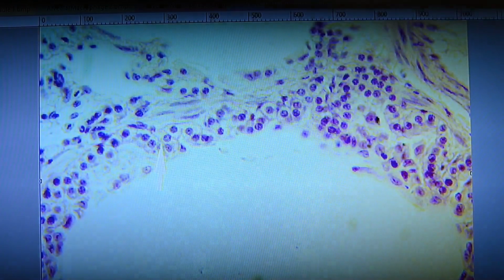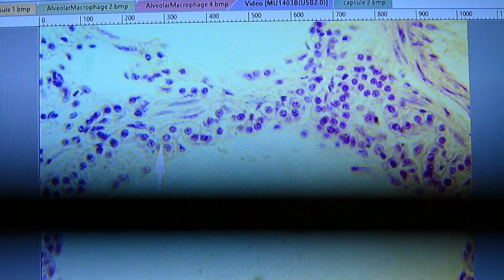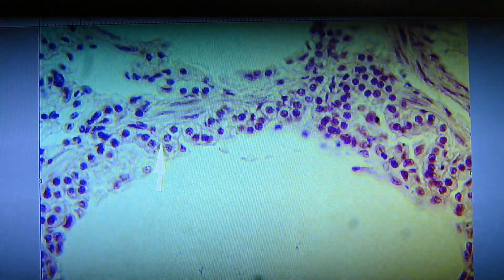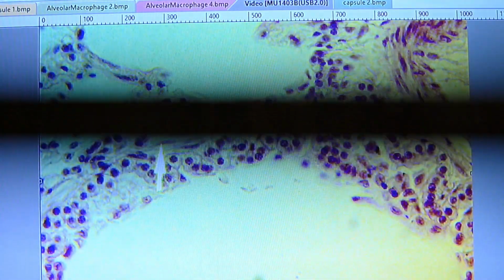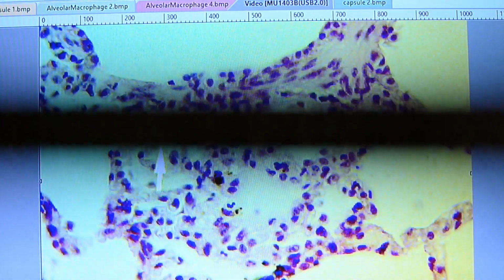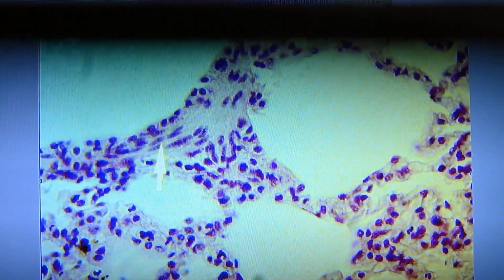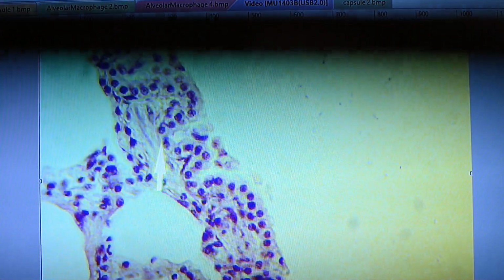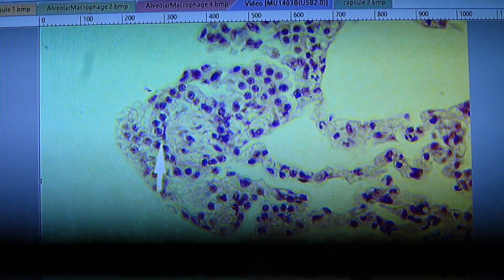This bronchiole here doesn't show any of the columnar or pseudostratified epithelium. We're all down to cuboidal epithelium along the wall. And there's still a little bit of smooth muscle worked in here. Don't see any glands right here where we're looking. Here's some more smooth muscle. Not that there couldn't be some glands worked in about this far down your bronchiole, but in this example we don't see any.